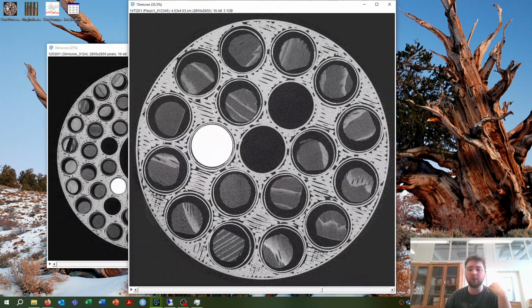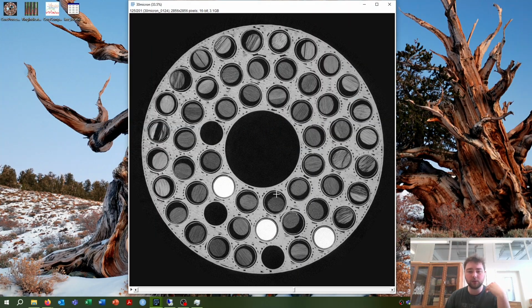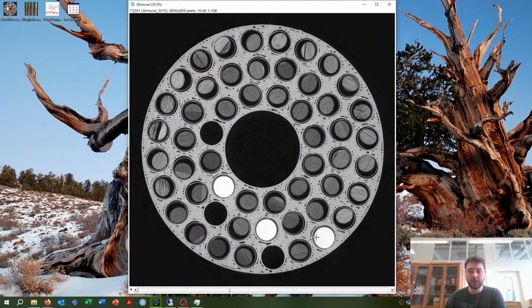with 16 samples. But we also have a medium and lower resolution holder, which looks like this. It can fit 48 samples, which you see, much more. If I go through it, again, the same. And here we have 3 reference pairs. So for each layer, there is 1 reference pair. Okay, so 1, 2, 1, 2.